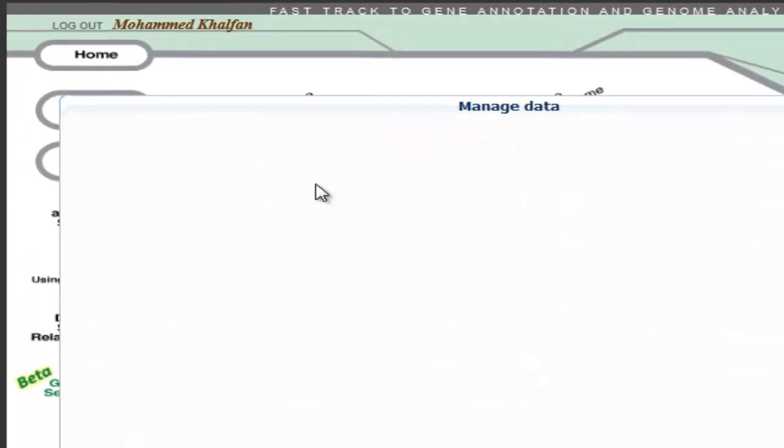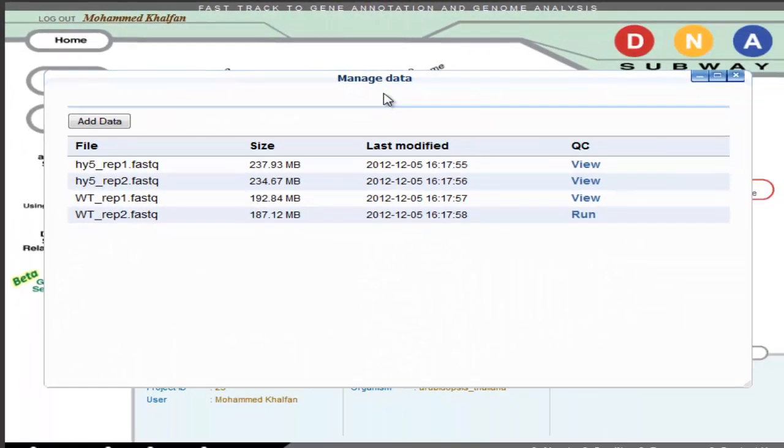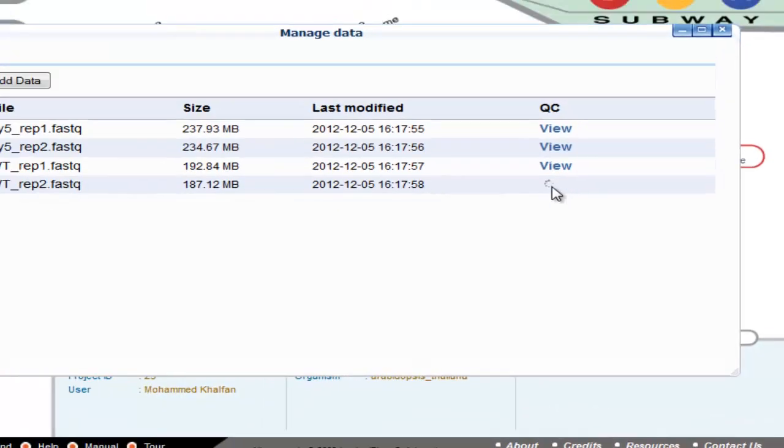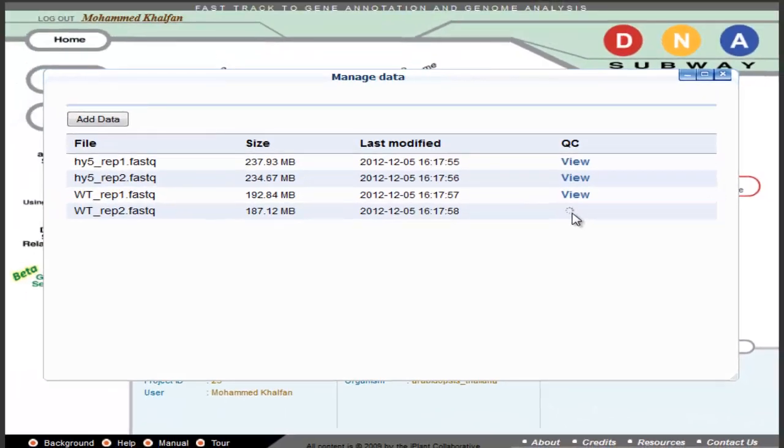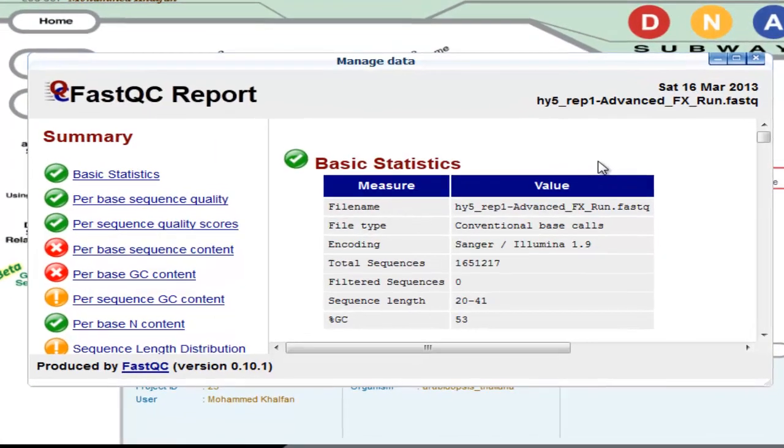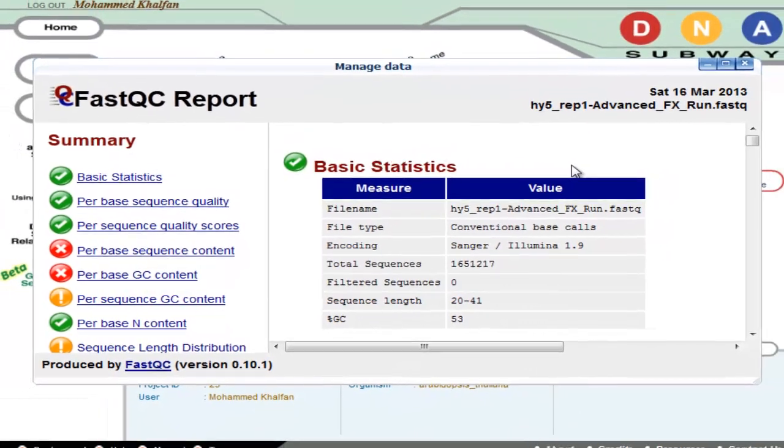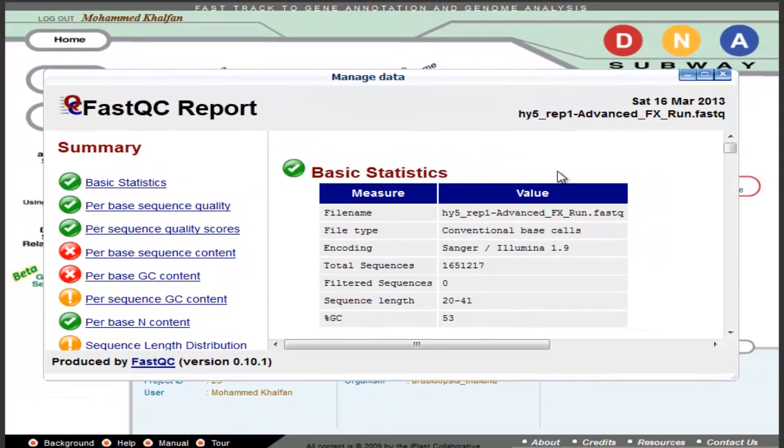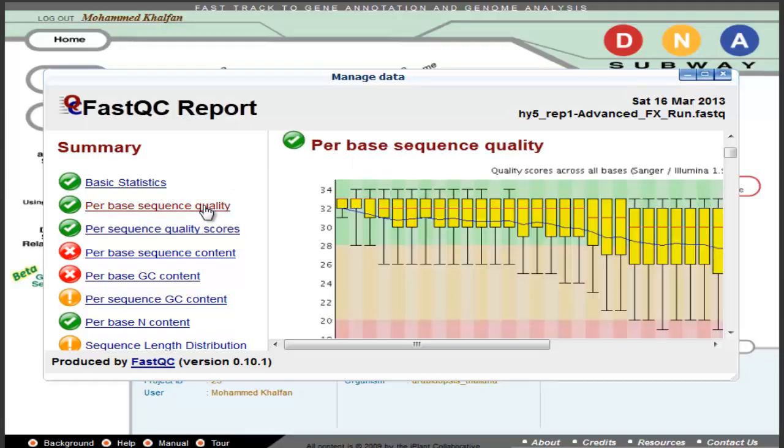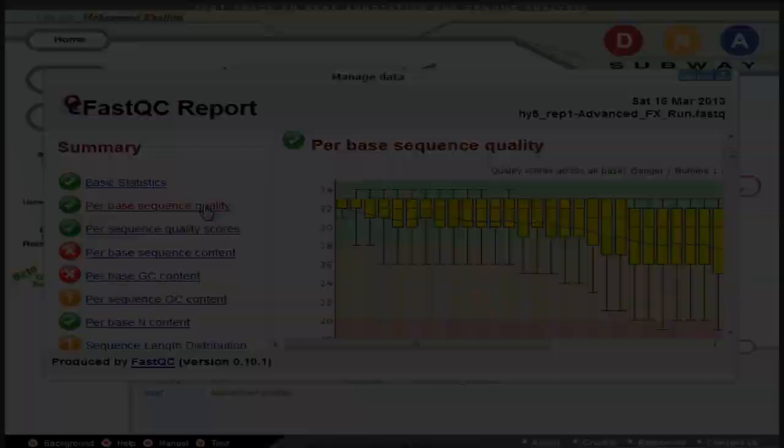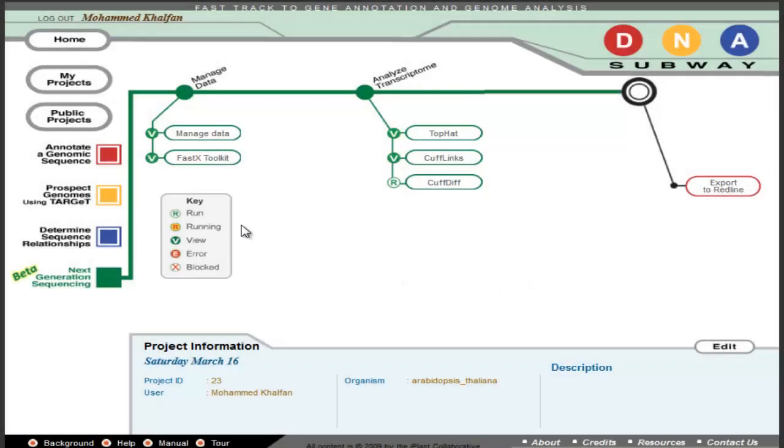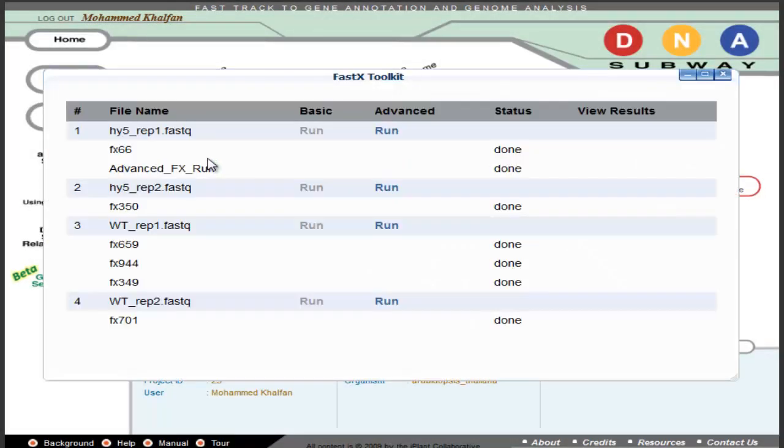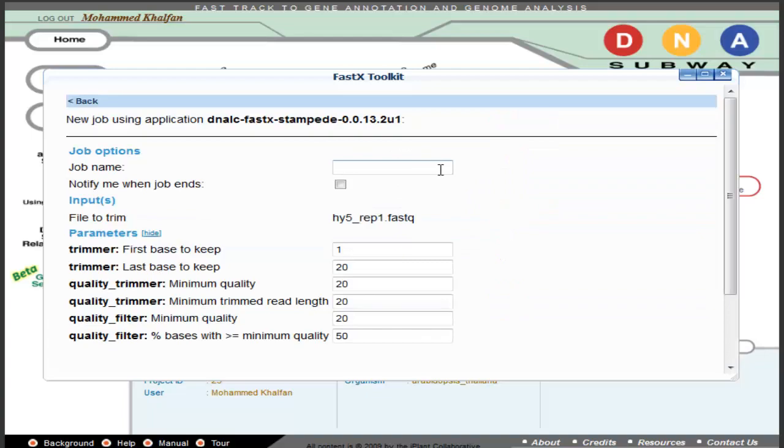managed data will allow you to view that data, add more, and run basic quality control checks. Viewing the quality control results will allow you to see basic statistics in the form of a FASTQC report. These reports will allow you to determine the quality of your data using the FASTX toolkit. You can filter your data using defaults by running the file using the BASIC option, or under ADVANCED, you can choose to set your own parameters.